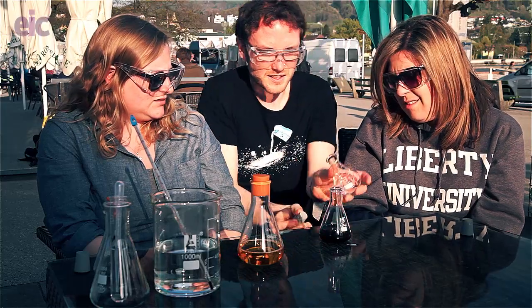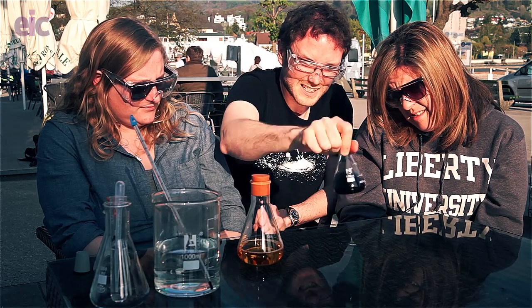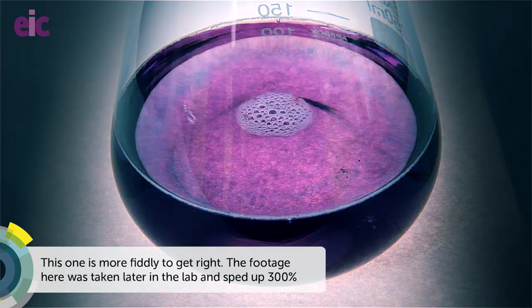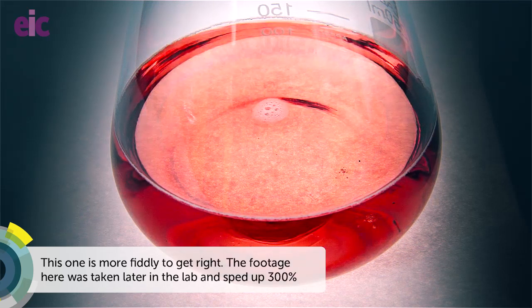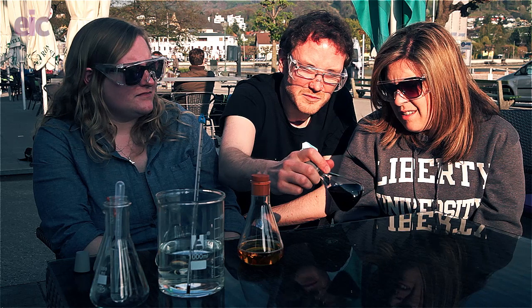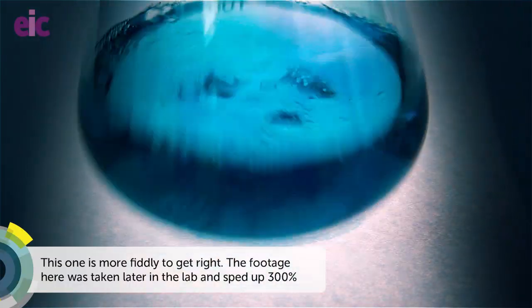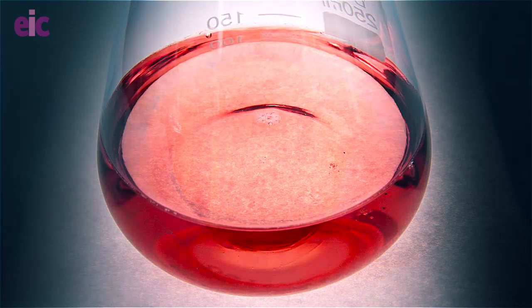We're going to add in the third mixture - this is actually glucose we're adding. What do you think is going to happen with the colors this time? We started off green before and finished yellow, going through red and orange. This time we're starting blue, so it should go to yellow. It's red-ish. The red and the blue makes purple, so it goes from blue to purple, then through to red, then orange, then yellow. It's going purple - yeah, it's going purple. It's like violet.